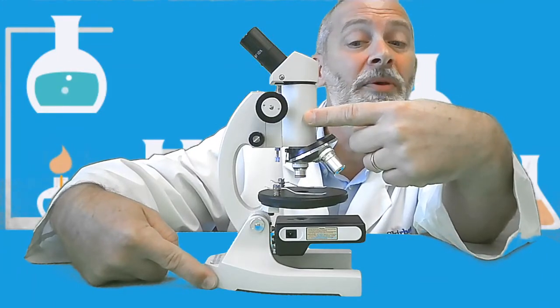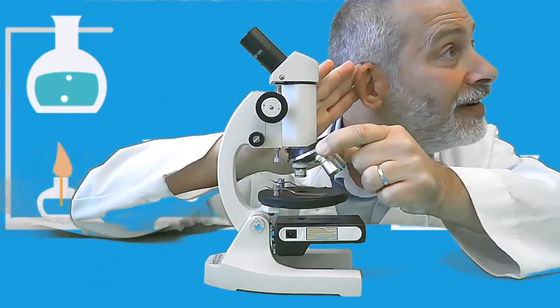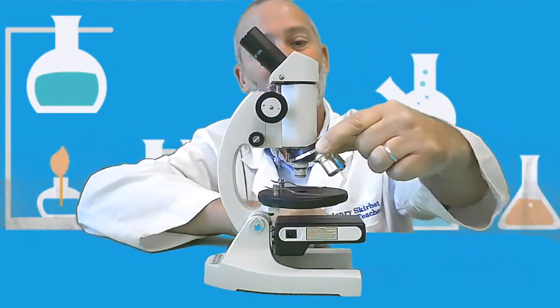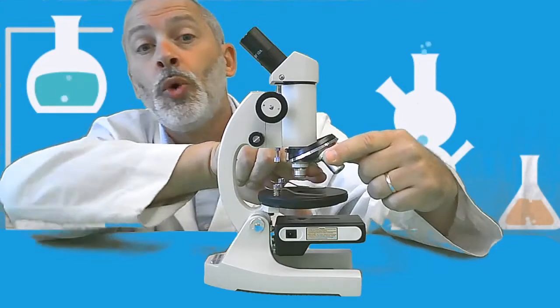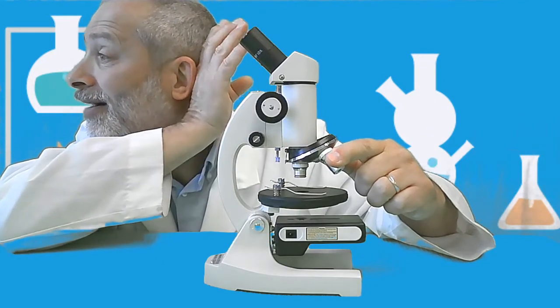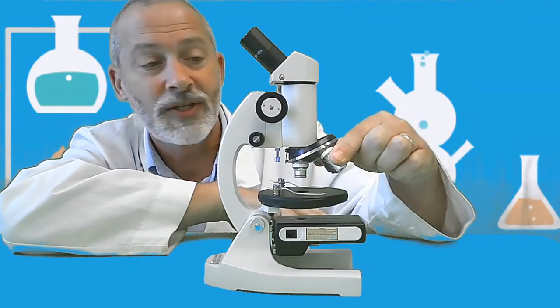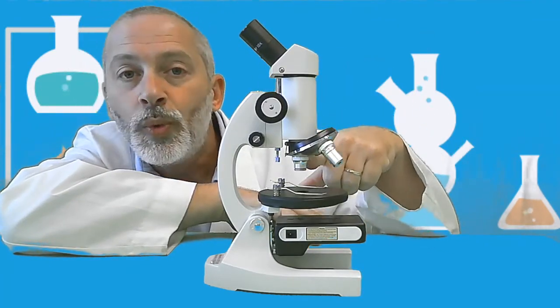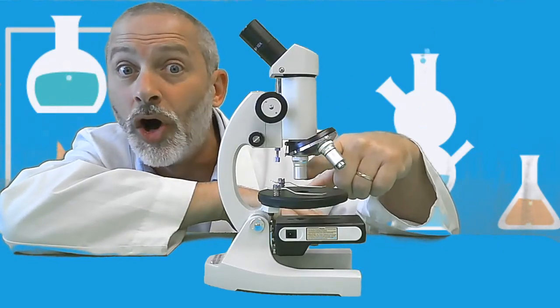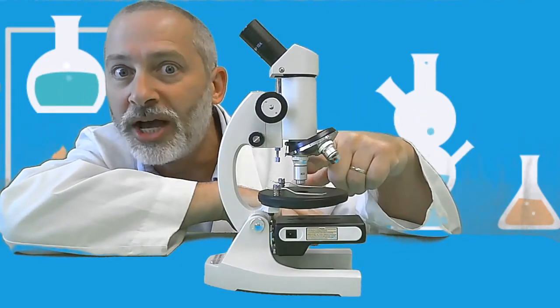Very good. And at the bottom of the body tube is this structure which rotates, and that's called the nose piece. Very good. And at the bottom of the nose piece, we have three of these little structures. What is each one of those called? Objective lenses. Now notice the objective lenses. We've got a short and squatty objective lens, and if we rotate, we've got a slightly longer objective lens, and we rotate even more, we've got a really long objective lens.